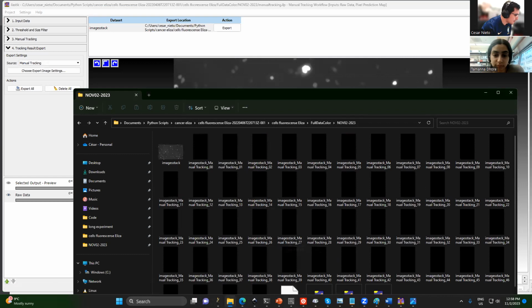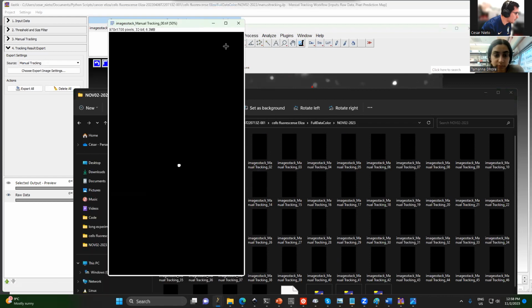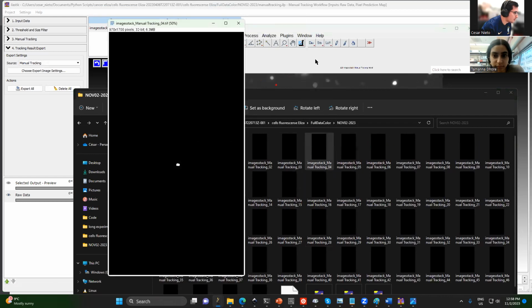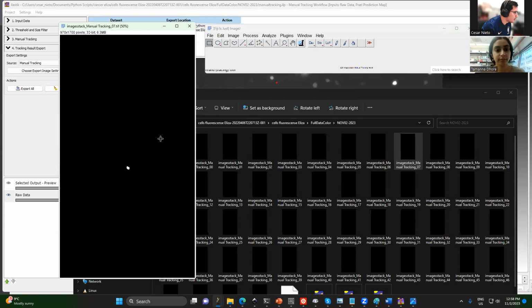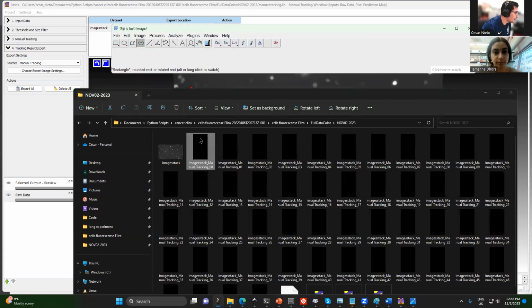Okay? Yeah, here we have only one cell, and we track it for 5 or 7 frames. Right. Yeah. But this is SL1. And I think if you track more than one cell, this image should be bigger. Oh no? Makes sense.